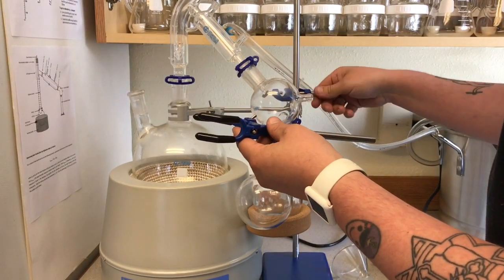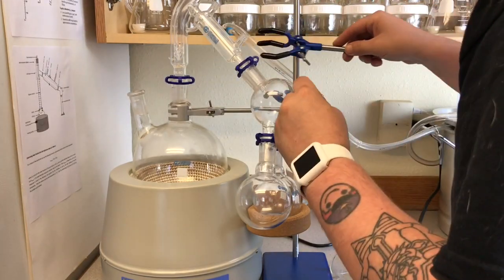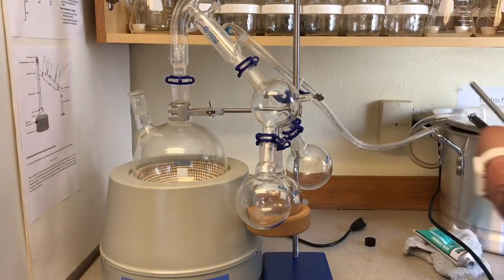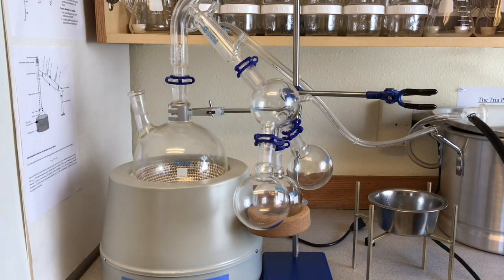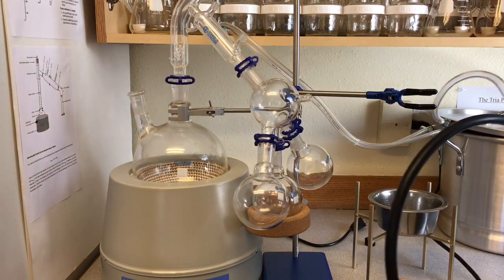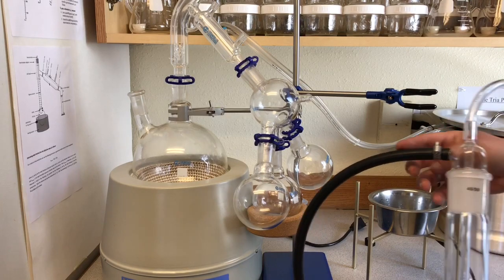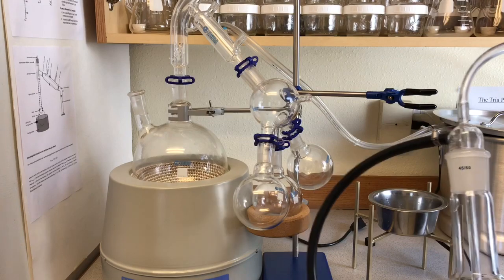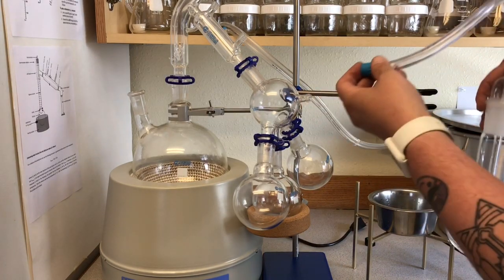And again, we've got another one of these boss heads. I'm going to take this guy and use it to hold our cold trap. So the next piece I'm going to connect is going to be my cold trap. Here's my cold trap here. This connection goes to my vacuum pump, and this connection will go to our distillation apparatus. So we're going to turn this guy like so, and this will end up going here.